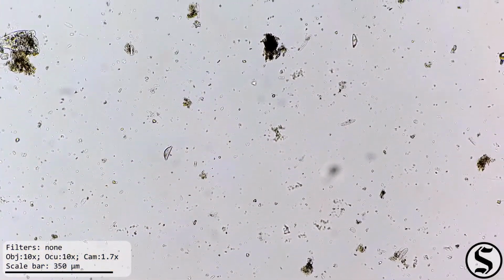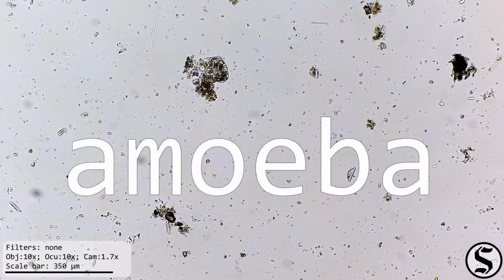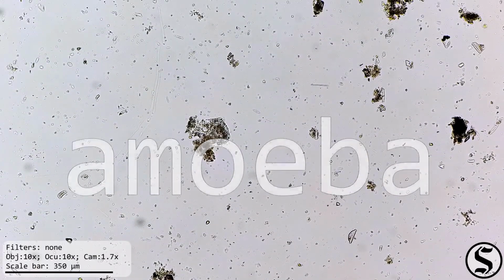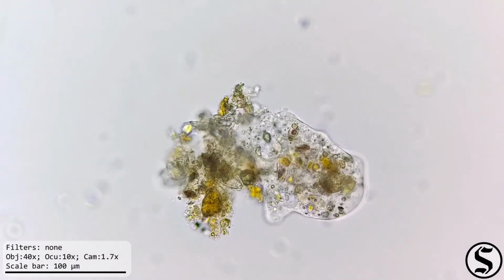And if you almost missed this like I did, I would understand, because this amoeba looked like just another piece of sediment as I was scrolling by. But that is definitely an amoeba.